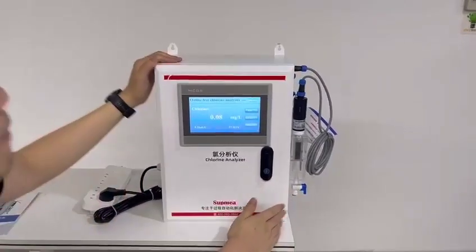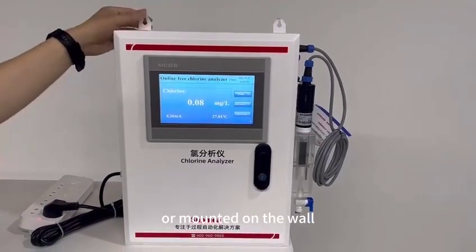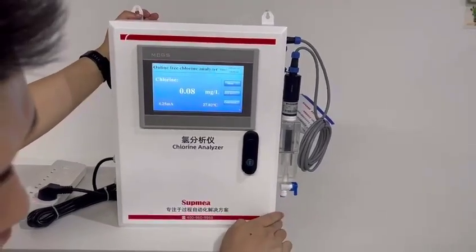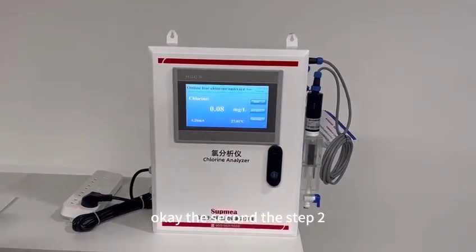This device can be installed or mounted on the wall or on the desk, but you have to make sure there is enough space for the water pipe to install.